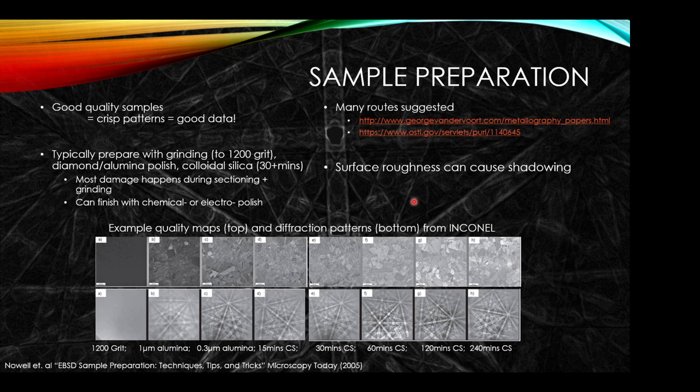For sample preparation, many of you will have to do metallography. You'll be doing polishing to effectively remove any impact of the sectioning process and get access to the crystals. If we remember that the EBSD signal is formed from the top 20 nanometers, we have to have a very good quality surface finish. This is a beautiful experiment conducted by Matt Null, showing that if you improve and increase the duration — decreasing the size of the media and increasing the duration — you can increase the clarity of the diffraction patterns.